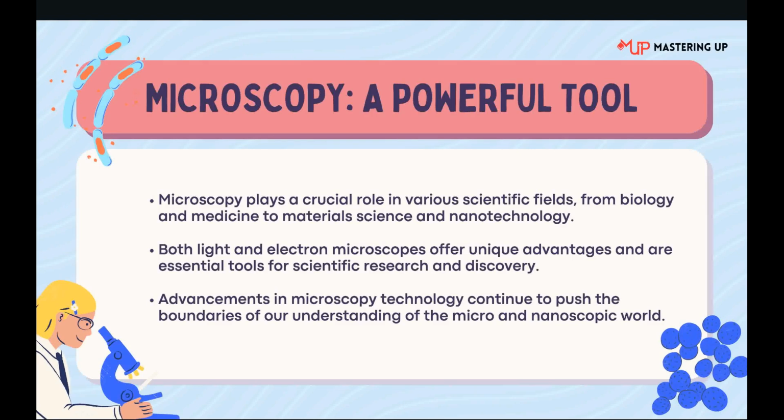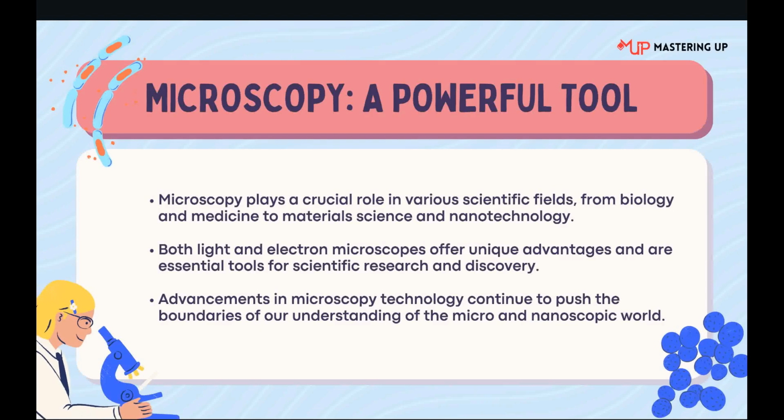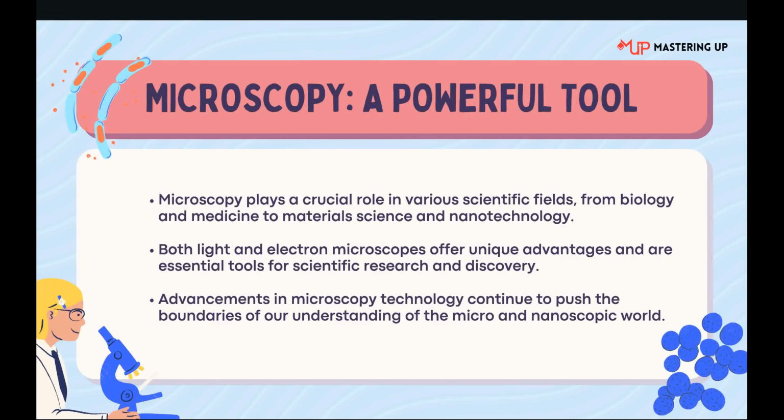Microscopy, a powerful tool. Microscopy plays a crucial role in various scientific fields, from biology and medicine to material science and nanotechnology. In this video, we learned light microscopy and electron microscopy in detail. With that, we could conclude that both light and electron microscopes offer unique advantages and are essential tools for scientific research and discovery. The advancements in microscopy technology continue to push the boundary of our understanding of the micro and nanoscopic world.